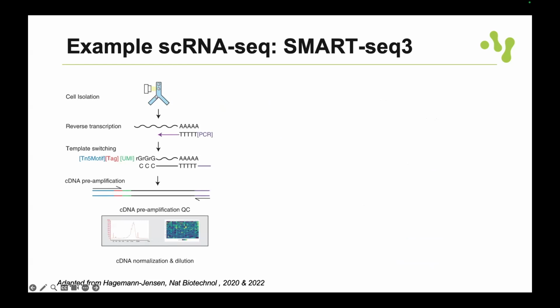So this could depend a little bit on cell type. I don't have any strict rule, but I would normally say I would prefer it to be above 200 base pairs, up to somewhere, trying to remember, is it 2, 3 kb?